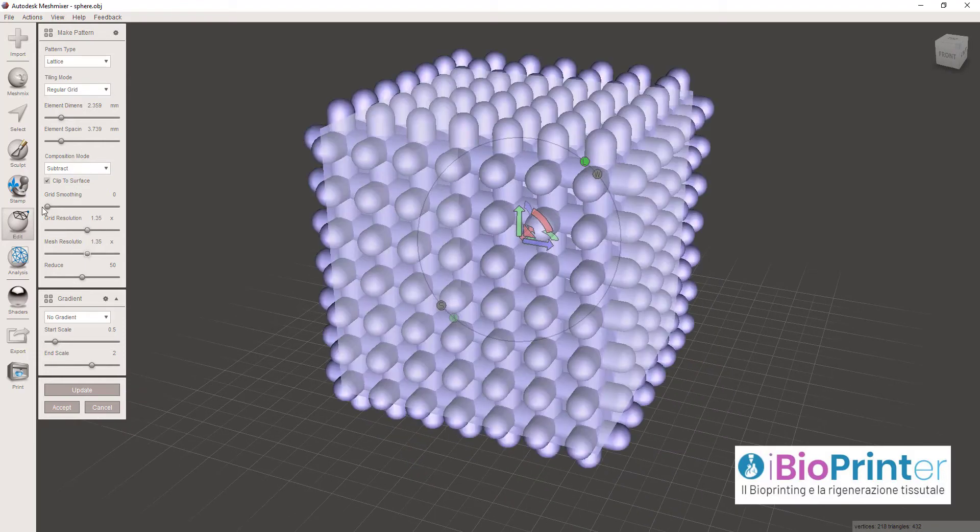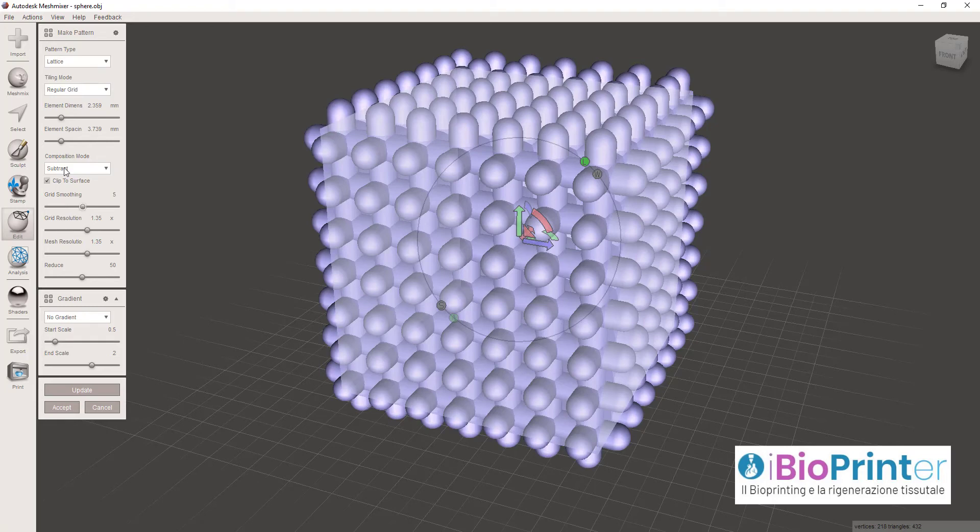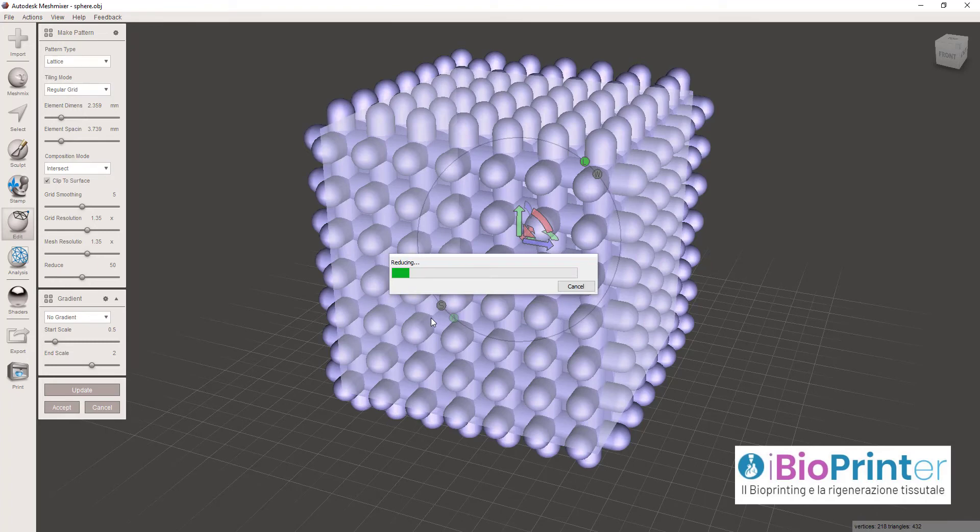Se io invece cliccassi su Intersect, vedrei la stessa struttura però negativa, cioè come se fosse scavata all'interno del cubo che la ospita.